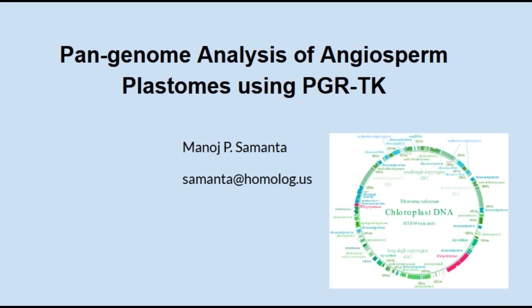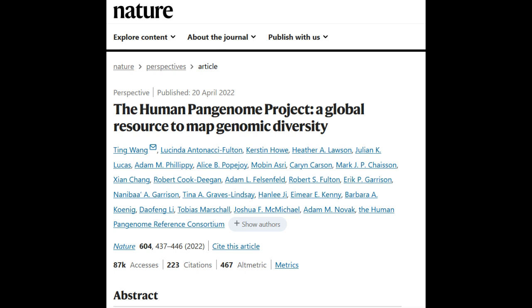Plastomes in this context refer to chloroplast genomes, since all green flowering plants have chloroplast in their leaves. Those chloroplasts are responsible for photosynthesis, producing food that both the plant and we benefit from. Finally, PGR-TK is a software tool that I'll discuss in more detail shortly. Now, why are we doing this and how did I get started on this problem?